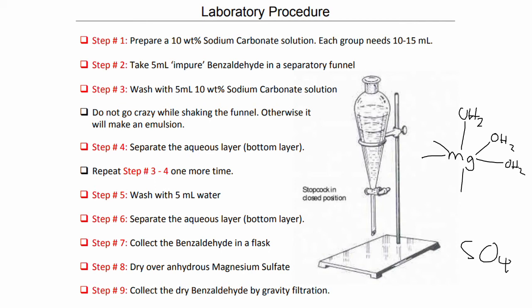This removes all of the water from our organic benzaldehyde. Once we've dried it, we filter it through a filter paper and collect our benzaldehyde.